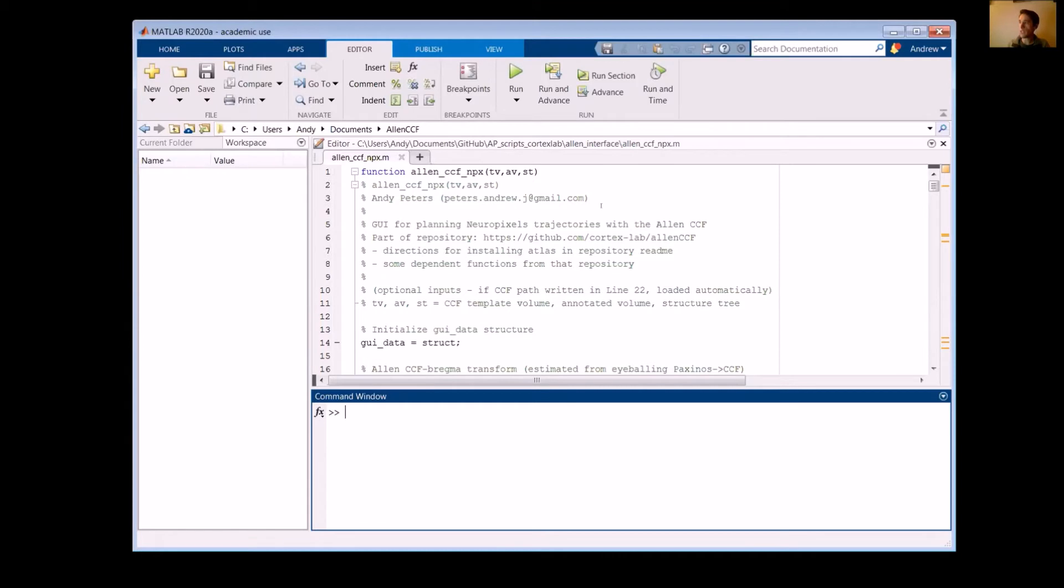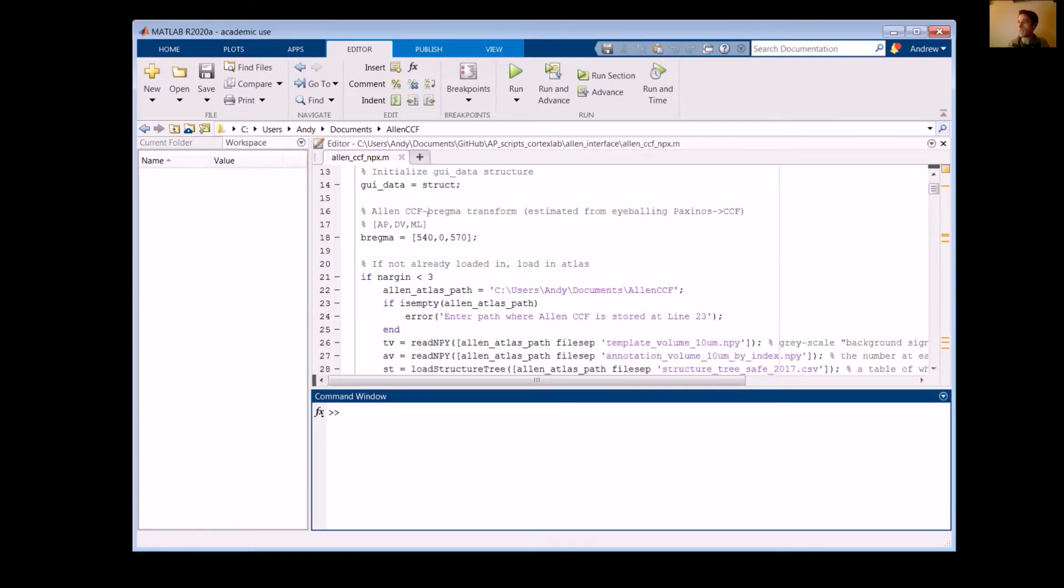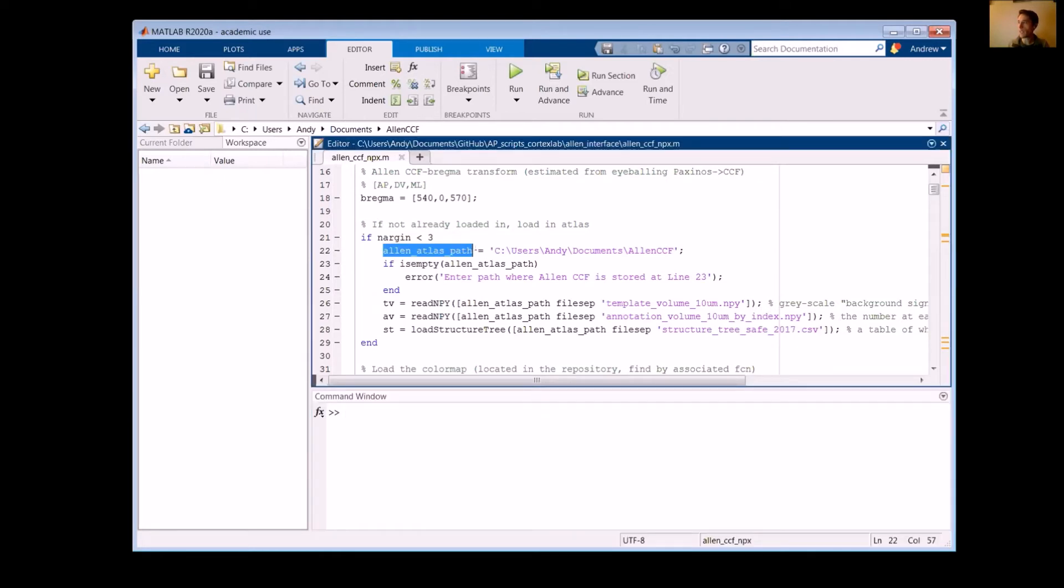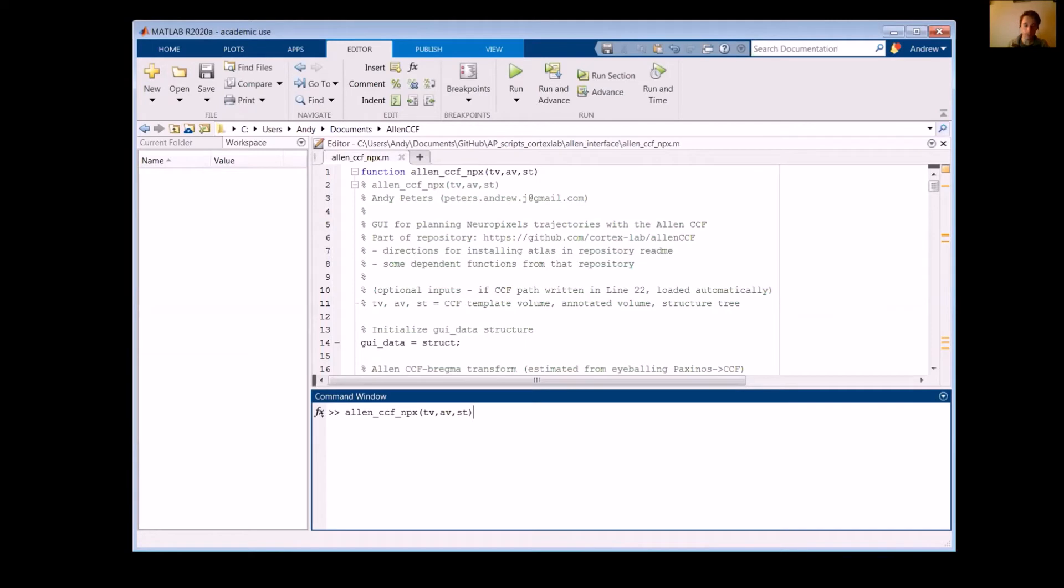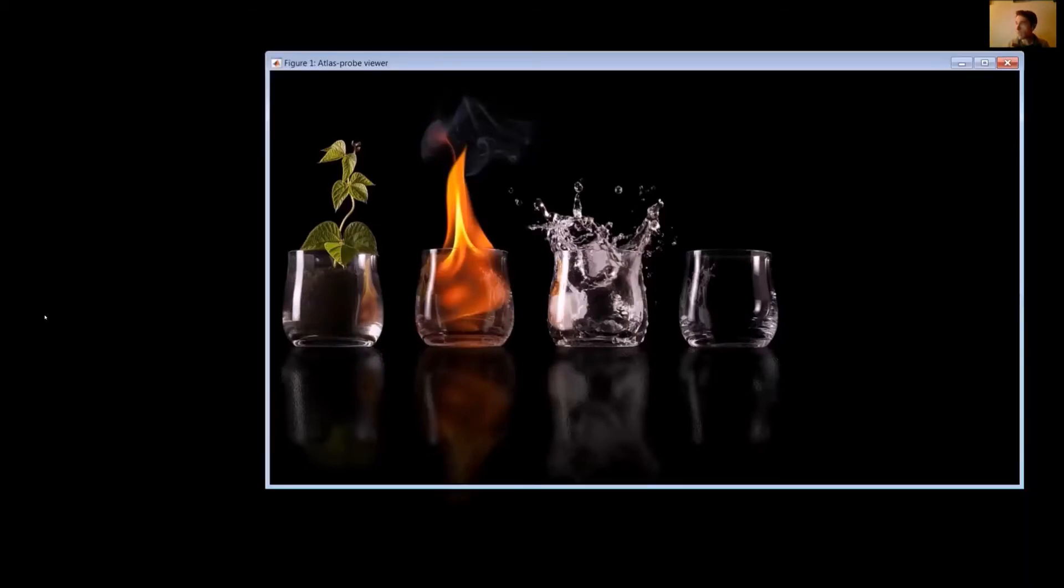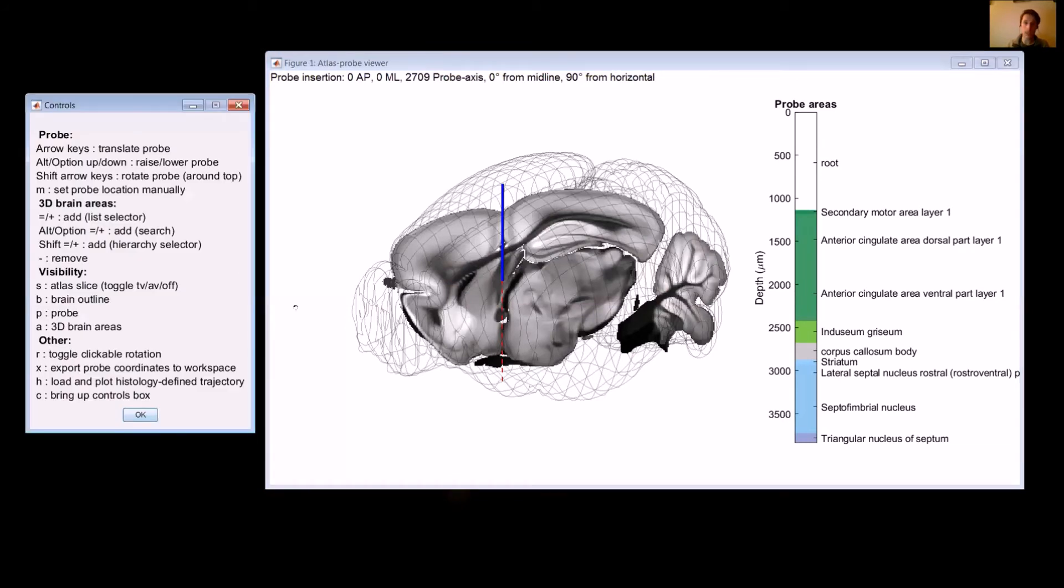The first thing you'll need to do is direct this function to where you keep your Allen CCF atlas. So this is the function that we're going to call, Allen CCF NPX. And the line that you're going to want to fill in is this line 22 here. So this is the path at which you have your Allen Atlas. It should be blank, I think, normally, but you want to put your stuff in here. So you can either put this here so that you can just run this command as is, or you can load in these things ahead of time. And then you can run it like this, so that it'll have the Allen Atlas already loaded in, and then it'll pull that when you run the GUI. So when you run that, the GUI that comes up looks like this. I'll just take you through essentially each one of these steps, and I'll show you what this looks like.